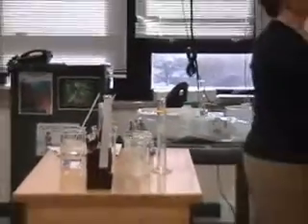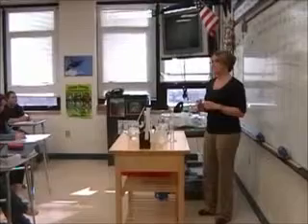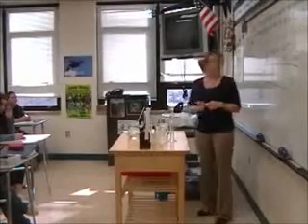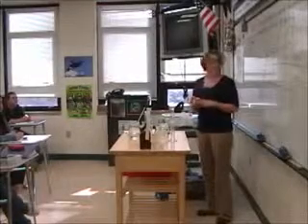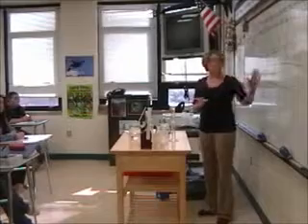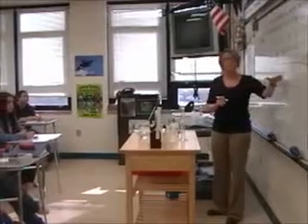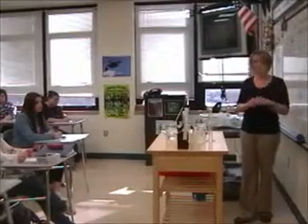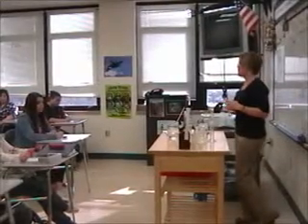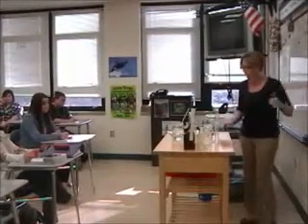All right, so let's make a prediction. Our cold is at about 5 degrees Celsius. So what do you think is going to happen to the reaction time? Increase. Do you think it'll increase a lot or a little bit? Is the time it takes to react going to increase or decrease? That's going to increase, right? We're going to have more seconds tick off. Is it going to be a lot more seconds, or just a few more? Just a few, maybe? We didn't have a whole lot of a reduction when it was warm, so we'll see.